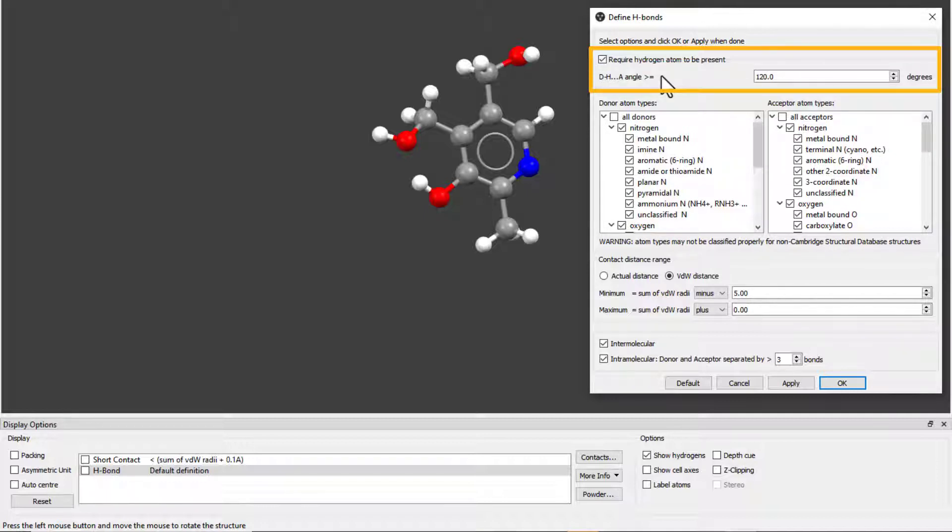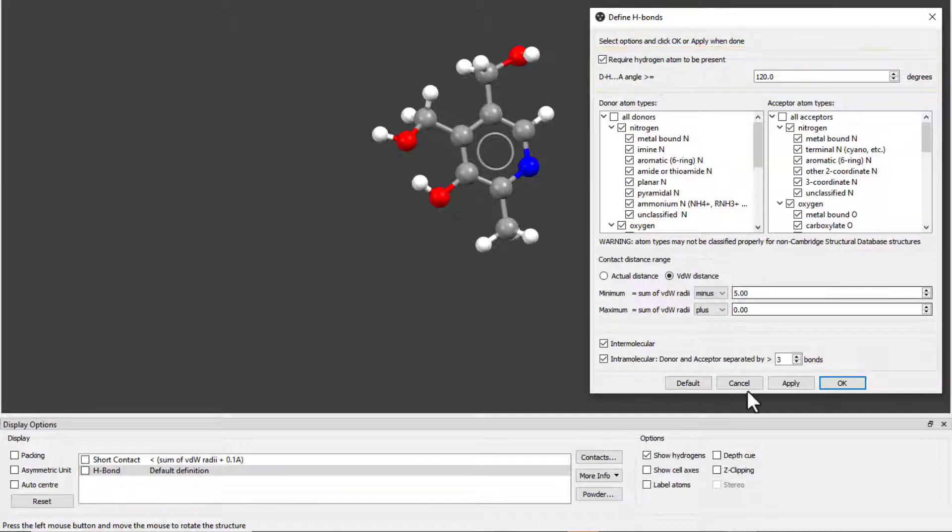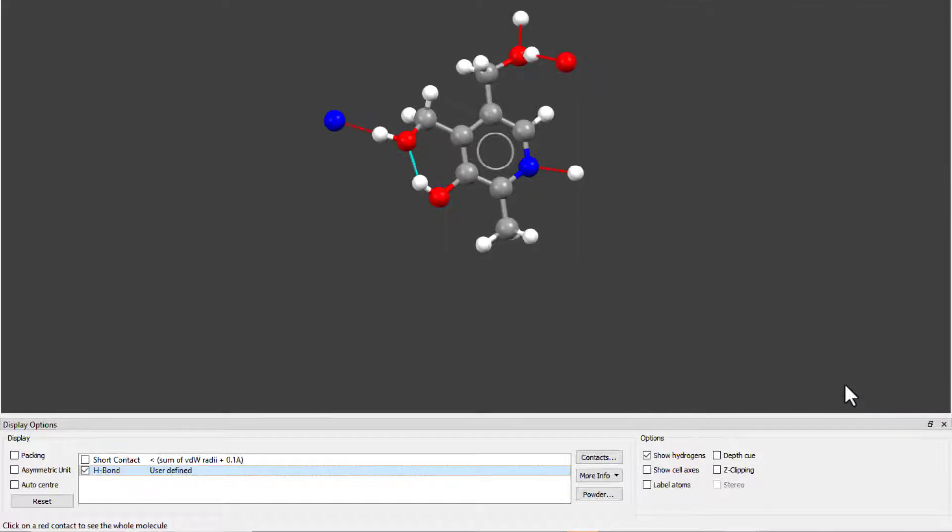For this example, we have ticked on the box to require hydrogens to be present and left the rest as the default. Click OK to save these edits.